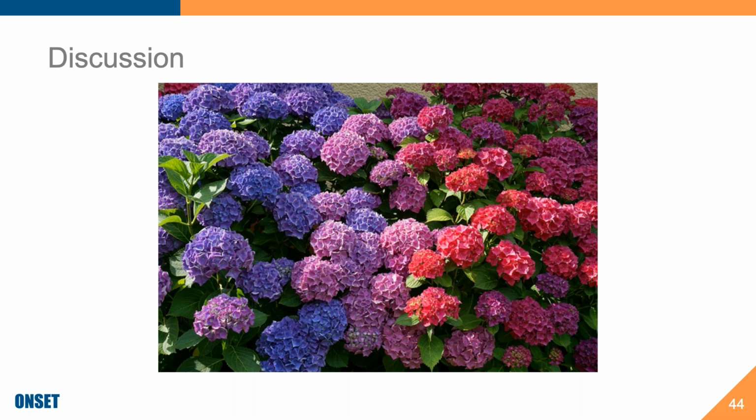If your electrode is going to experience two drastically different temperatures within the same experiment, should you calibrate them in both temperatures? Good question. Yes, I'd be interested to hear what the two temperatures are. But yes, that would be interesting to see. I haven't heard of anyone doing that myself. So yeah, that's interesting.